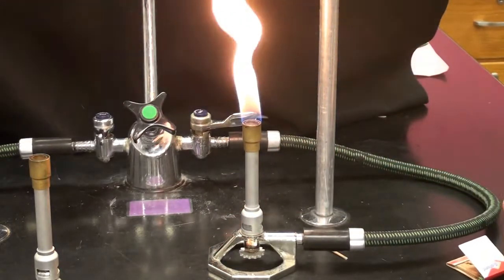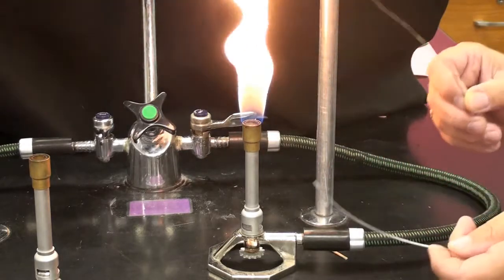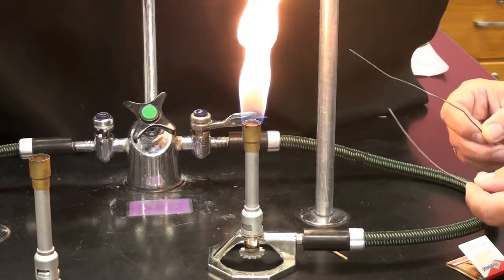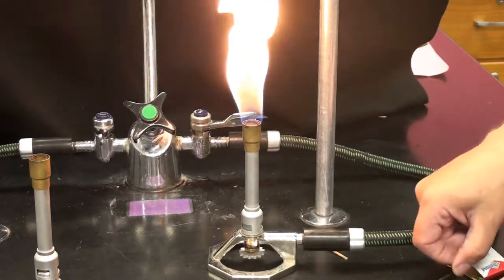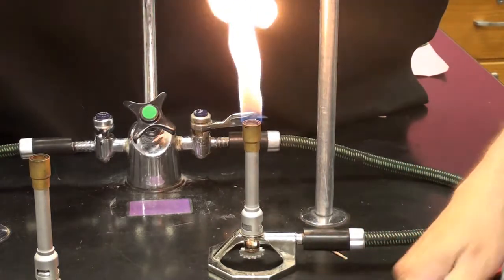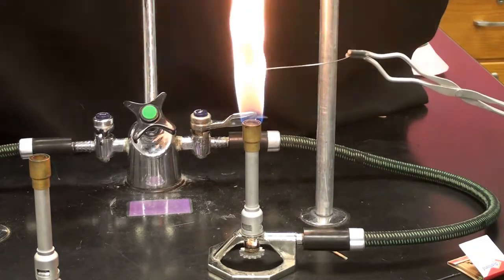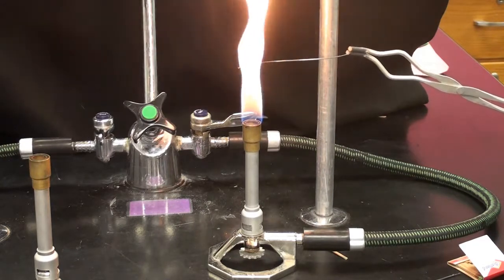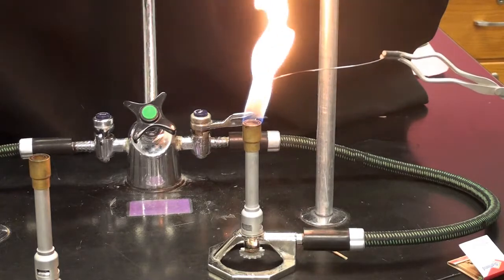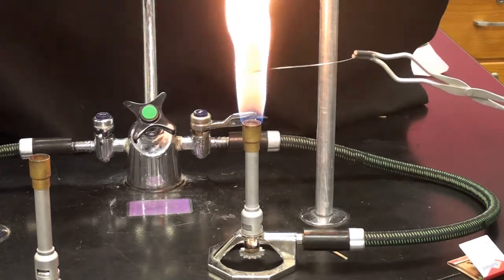Well, one way I can find out is I've got two different wires here. I've got an aluminum wire and I've got a copper wire. One of your jobs will be to look up the melting point of aluminum and the melting point of copper and see how hot it has to get for these things to melt. So if I place this aluminum wire here in this flame, I can see it's getting kind of a soot on it, but I'm not really seeing much else happen.